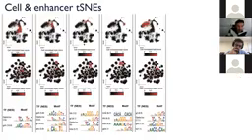So here are some results on the eye-antennal disc for different topics. Every column here is a topic, and you can see the cells that like this topic. So these are the cells that are anterior to the morphogenetic furrow, the progenitors. And this here is a t-SNE of all the regions in the genome that have some signal. They're clustered by their topic loading. And in this cluster here that is red, these are the regions that belong to this particular topic. So these are the regions that are accessible in these cells.